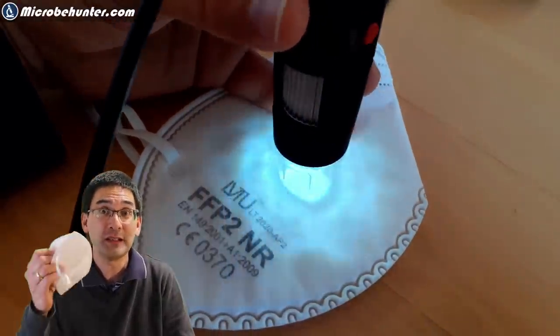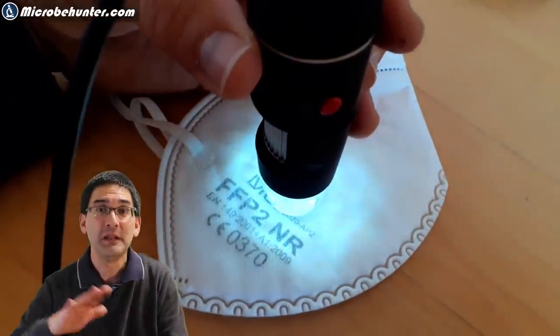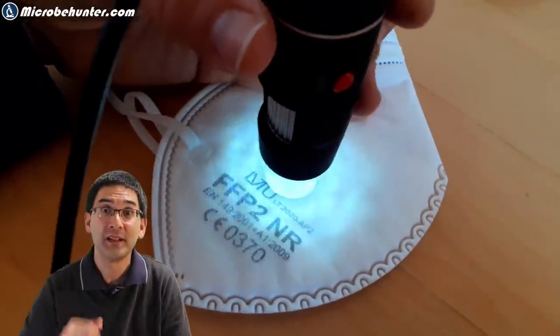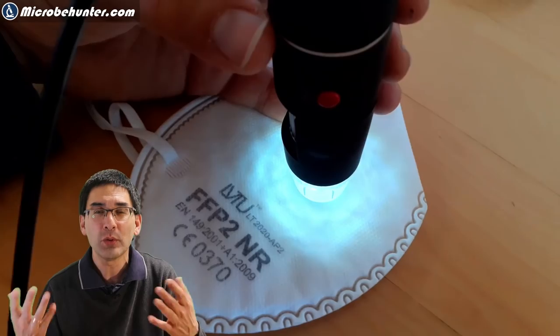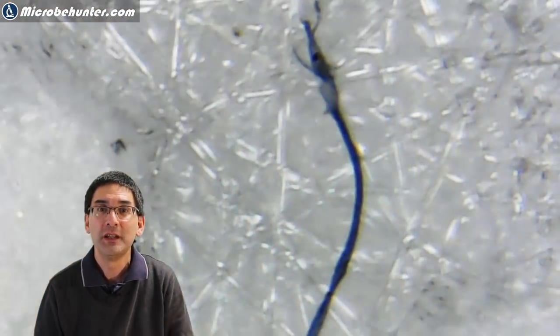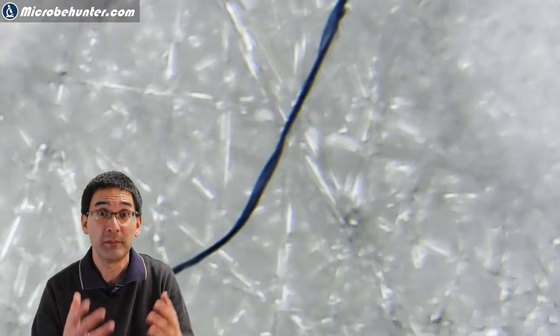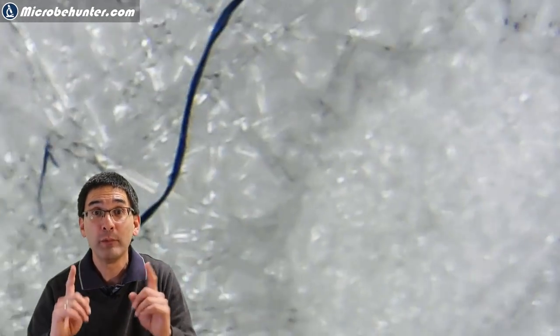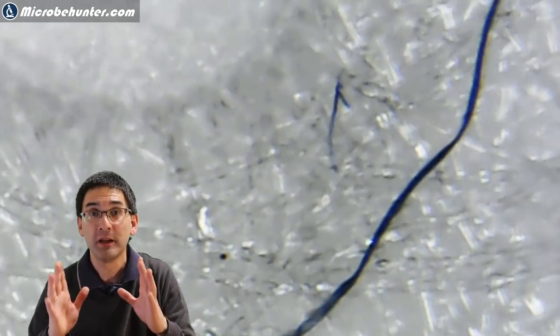Now what I have done is I took the face mask and put it directly beneath a very low-cost handheld microscope and even they were able to reveal those textile fibers. Now most of them are not moving right now but later on I'm going to show you what you have to do to make them move.